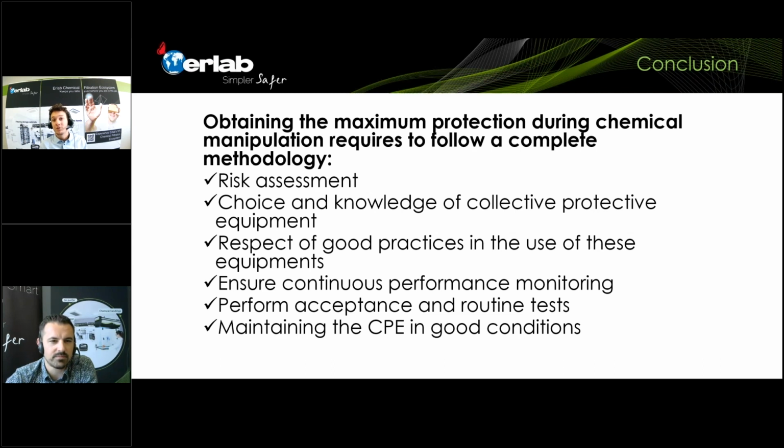Well, when you need to change the filter based on our recommendations, our laboratory is going to calculate the lifetime of the activated carbon filters. But as I said in one of my responses to another question about the acid sensor, we have 3 sensors which you can place after the first layer of carbon filters. These sensors will detect the chemicals coming through the first layer of carbon filters.